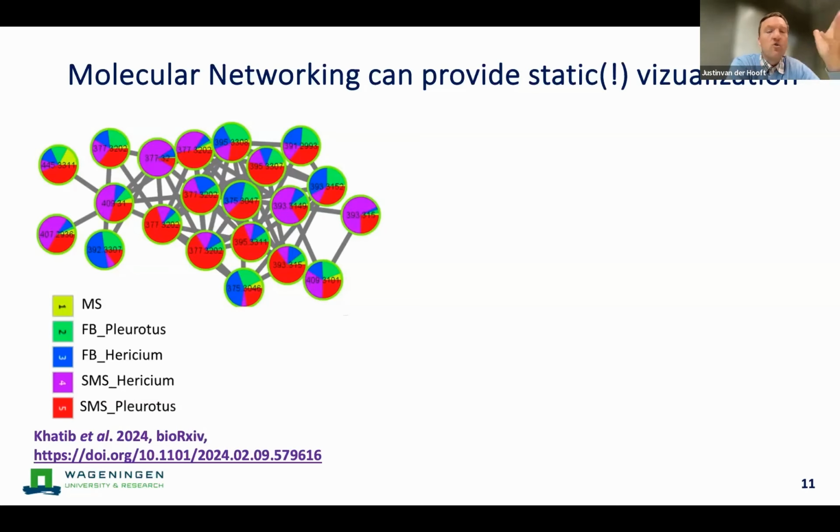So we can quickly check whether or not the metabolite features are most likely to be biological, which I think all of them are in this particular group, as you may already have seen, because there's hardly any yellow. But other than that, it already starts to become more difficult to find information from a plot like this. Of course, if you have some pre-knowledge, you can start to investigate. You could also choose to do some statistical tests and somehow plot them or use them to color the nodes as well. But as you can imagine, it also becomes quite a dense job to do this for 4,000 nodes.